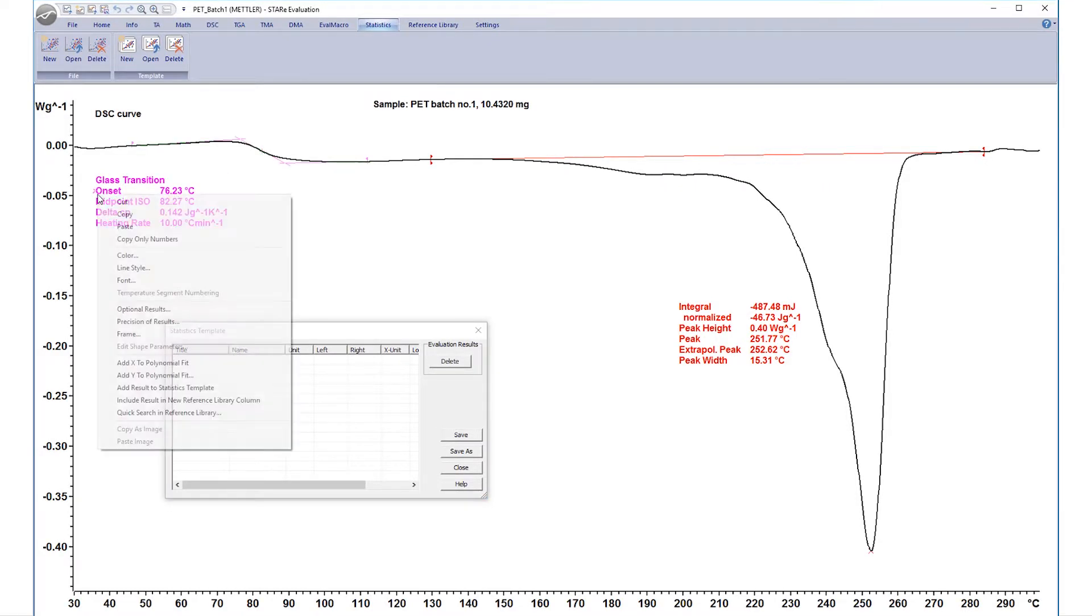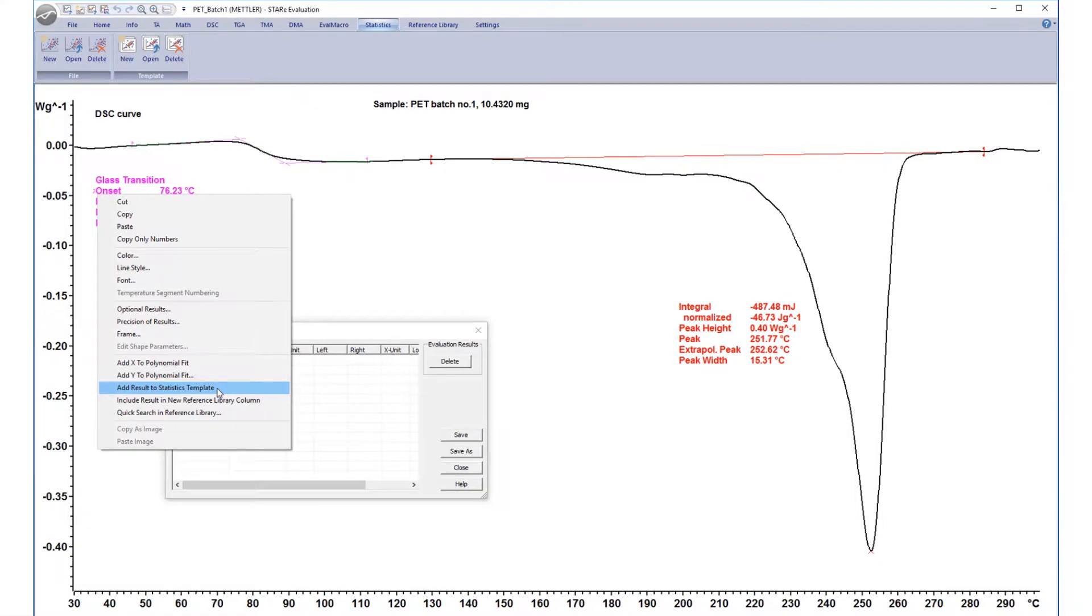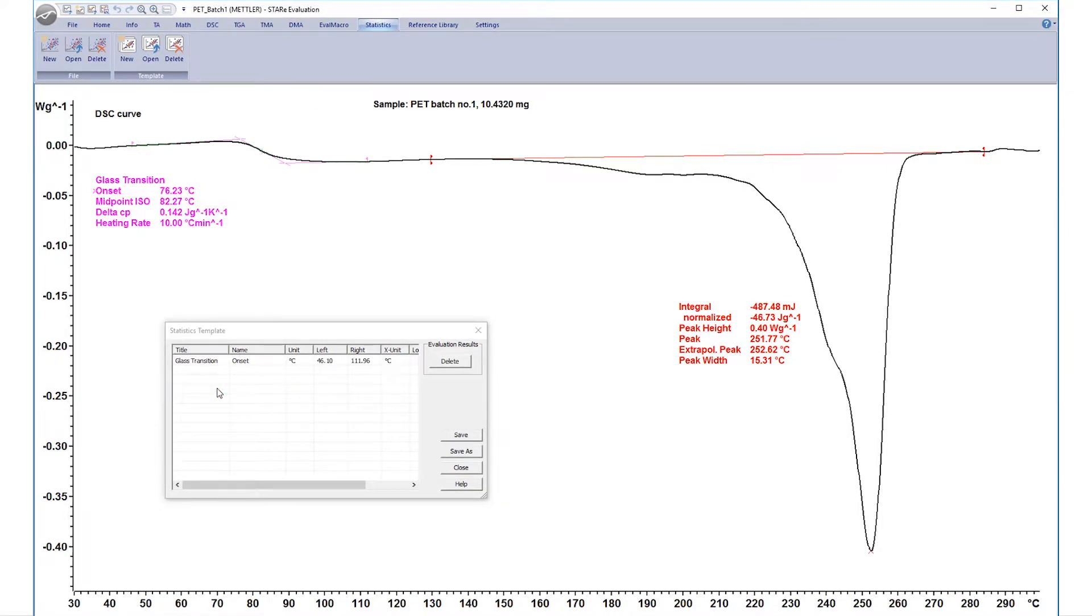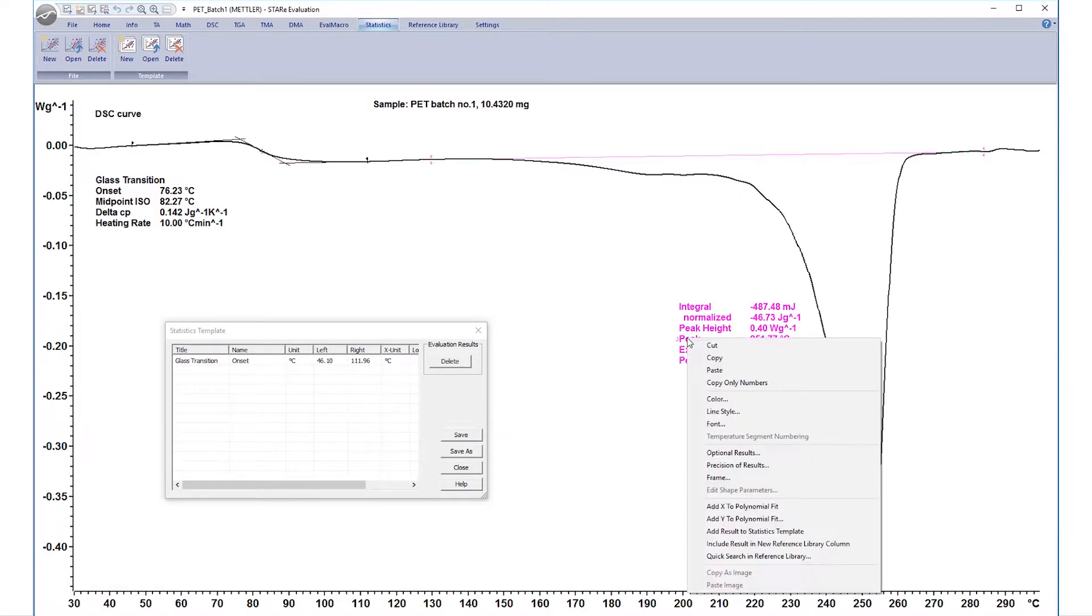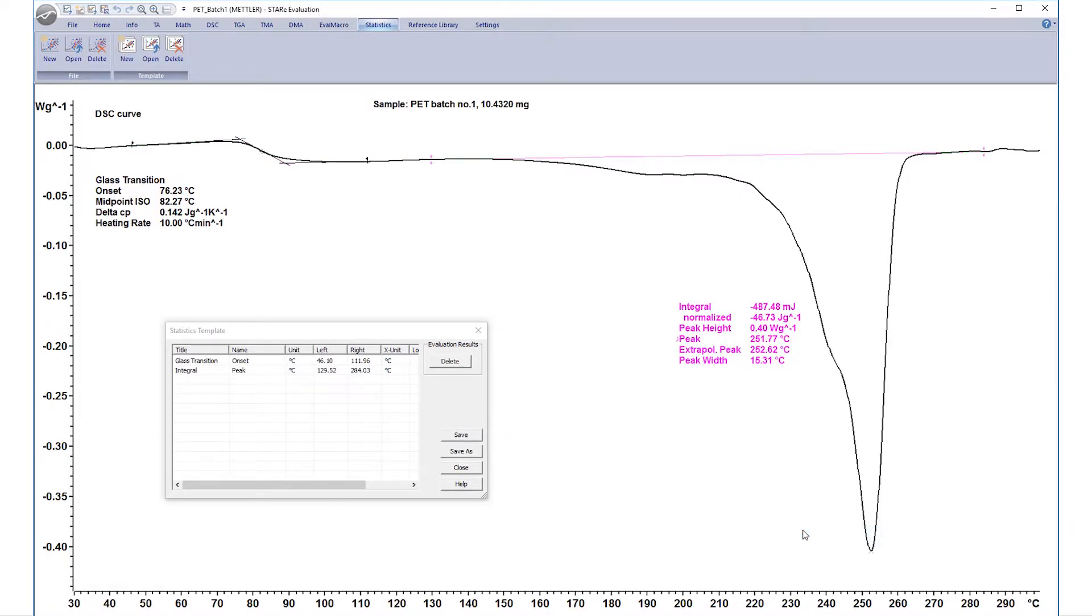Right-click and select Add results to Statistics Template. Select from the drop-down menu. In this example, we have determined the glass transition and melting temperatures on the second heating run of PET.